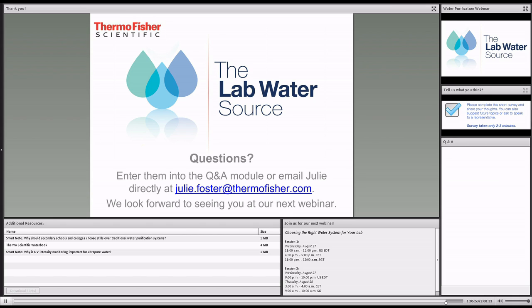Well, an ultra-pure water system, if you meet the incoming feed water requirements, should take everything out of your water. When it's configured with a UV lamp and an ultrafilter, it should take everything out. That solution doesn't always work for every customer. That would be like a tap to Type 1 solution. Sometimes the right answer is multiple water systems.